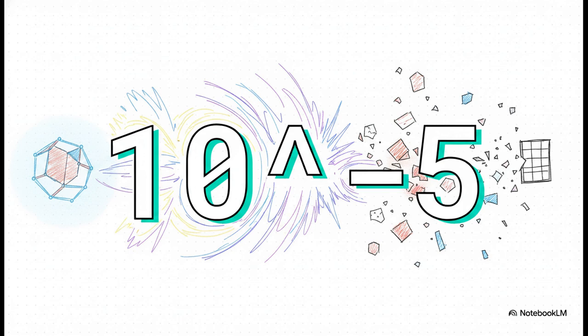If the molecular ion can somehow hold itself together for longer than this incredibly brief window, it gets accelerated through the machine and hits the detector totally intact. But any ion with a lifetime of less than 10 to the negative 5th seconds, it will spontaneously shatter before it can even be accelerated out of the ionization chamber. It literally vibrates itself to pieces right there on the spot.